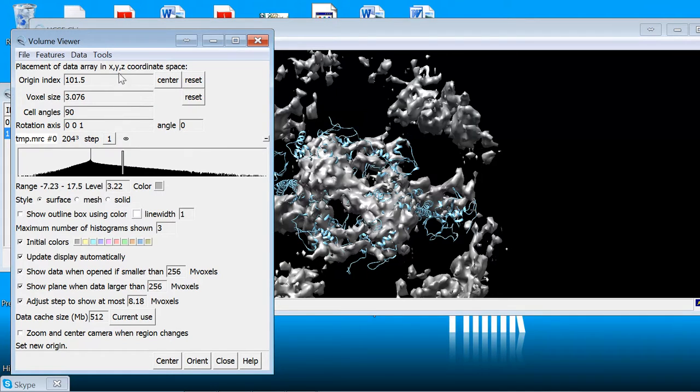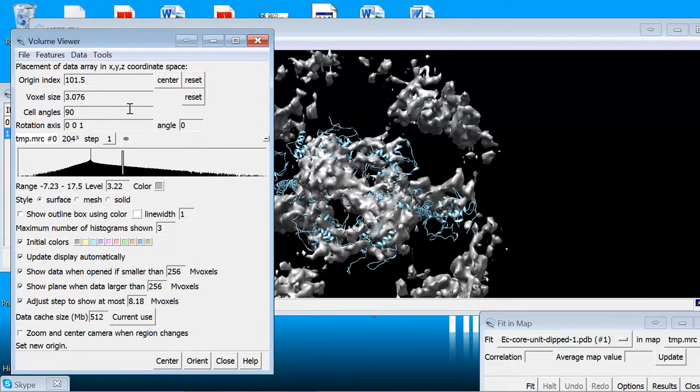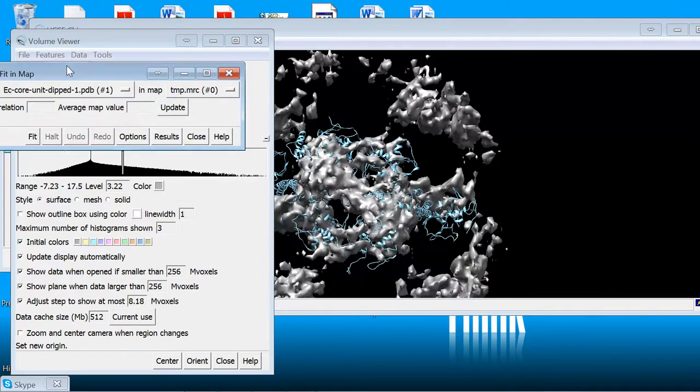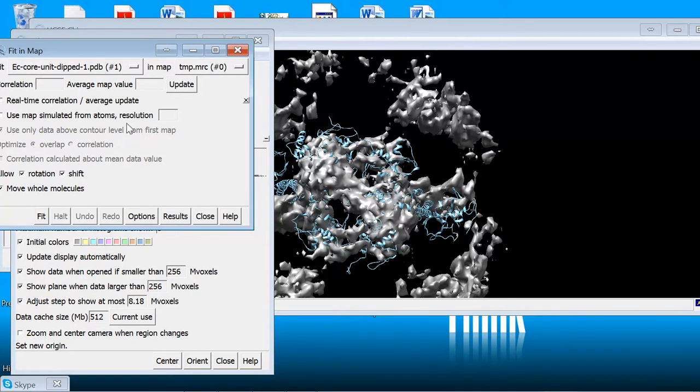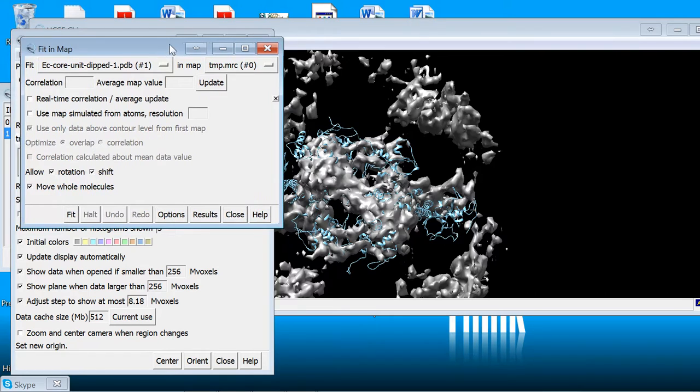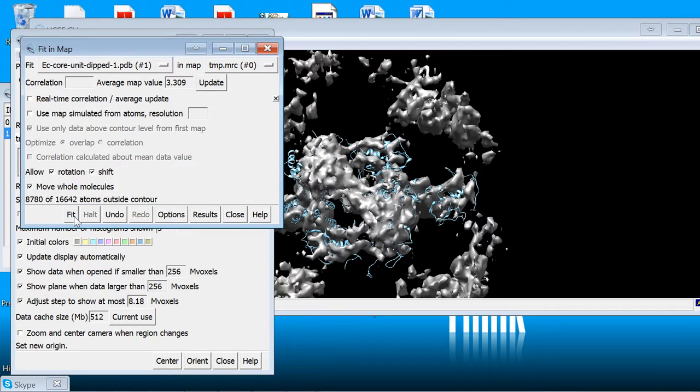Now that this is close, we're going to go back to the volume viewer, look under tools, and fit in map. Now depending on the analysis you're doing, you can go to options and actually use a map simulated from the atoms at a given resolution. For now I'm just going to fit it based on overlap. And you see it just snaps it in really quick.